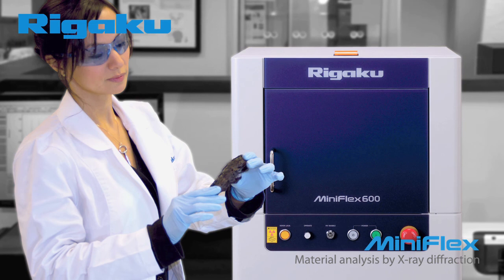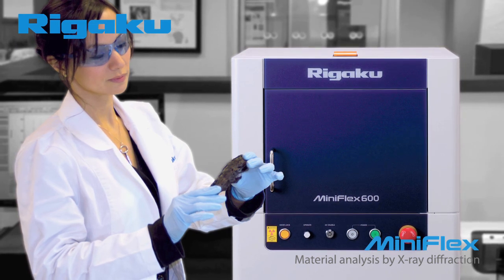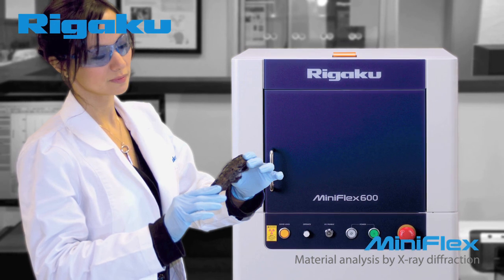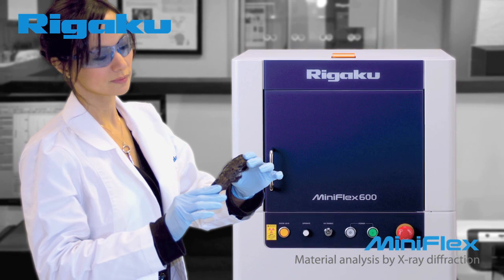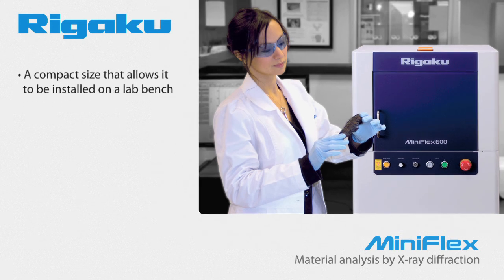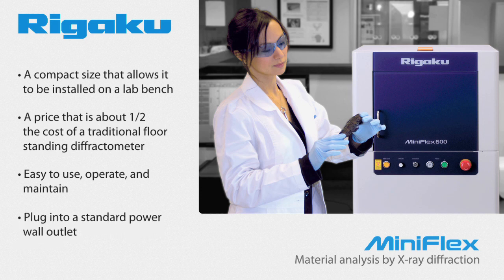The original MiniFlex was based on the idea that a compact XRD instrument could be designed that a novice could use to produce results as good as those obtained by a trained diffractionist. The new MiniFlex retains the characteristics that have made it popular for so many years, which include a compact size that allows it to be installed on a lab bench, a price that is about half the cost of a traditional floor-standing diffractometer, easy to use, operate, and maintain, and plugs into a standard power wall outlet.